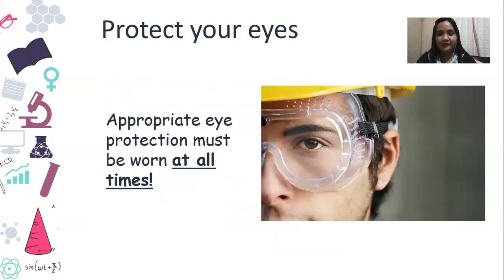So next, protect your eyes. Again, lately this has been an issue of the face shield, but for the laboratory, for activities involving fumes or strong smell of chemicals that might affect your eyesight, please request for goggles, or we will be giving you goggles to protect your eyes. So appropriate eye protection must be worn at all times.